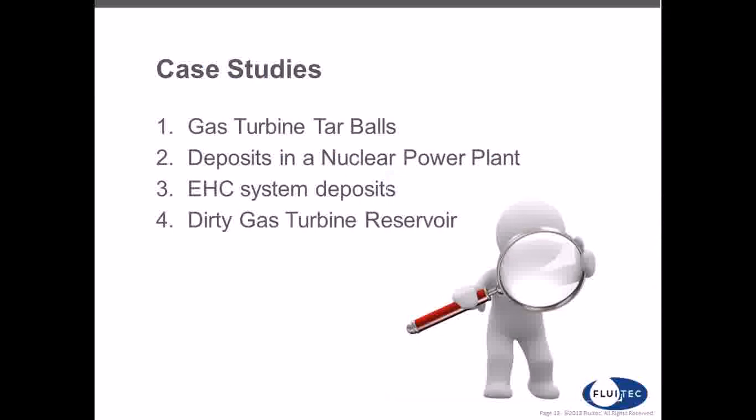So I have a case study here on a gas turbine with what we call tar balls, deposits in a nuclear power plant, EHC system deposits, and another one from a gas turbine with a lot of deposits in the reservoir.